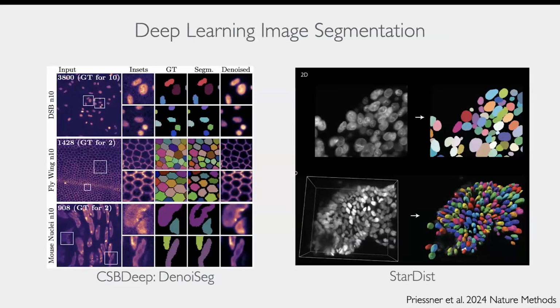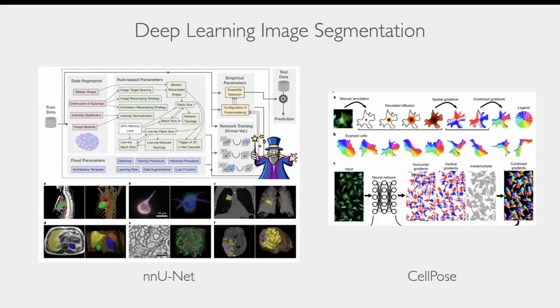And then following on from that, we'll get into segmentation and the right tools for the right job. So whether it's just being able to segment in a way that's better than using Ilastik, or deal with very tightly clustered nuclei, as you may find in very dense cell tissues where nuclei are really just touching each other. It's very hard to separate them. But also in other types of cells, like the example I gave at the beginning, where all the cells are really touching, how do you separate those cells reliably so that you can actually measure their volume? And so we'll look at some tools for doing that.